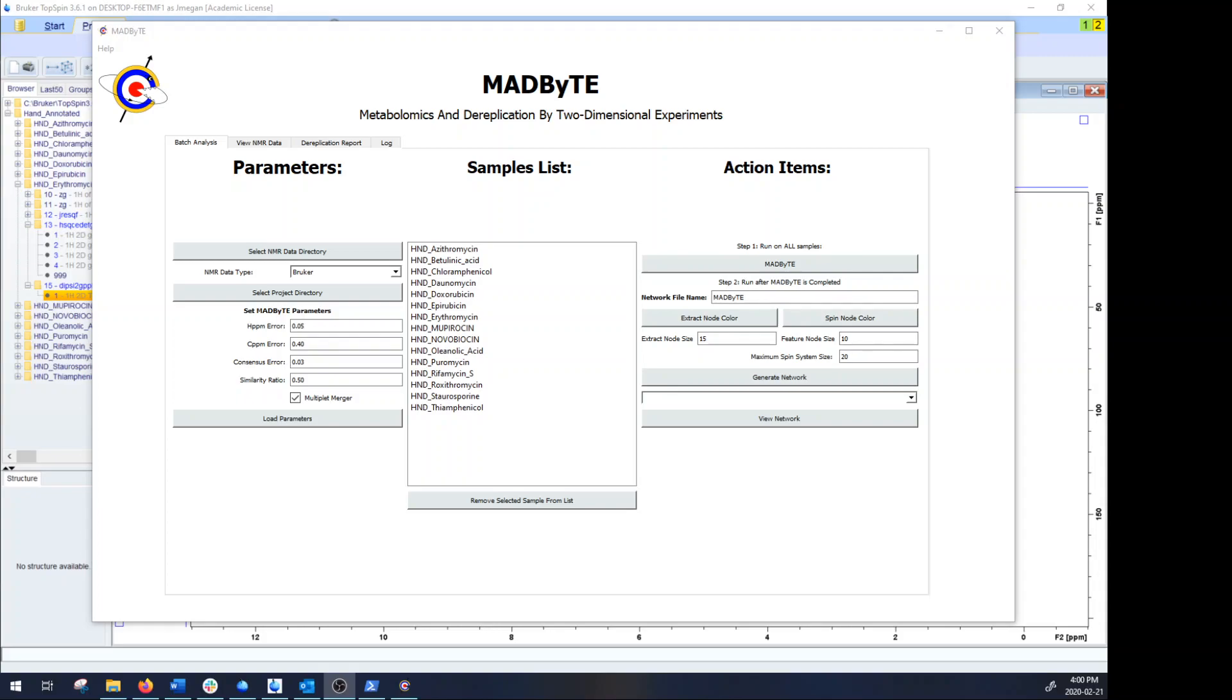Hello and welcome to step three of using Madbyte, which is actually creating the networks that Madbyte uses as outputs. For this we're going to use the right hand side of the platform where it says action items.